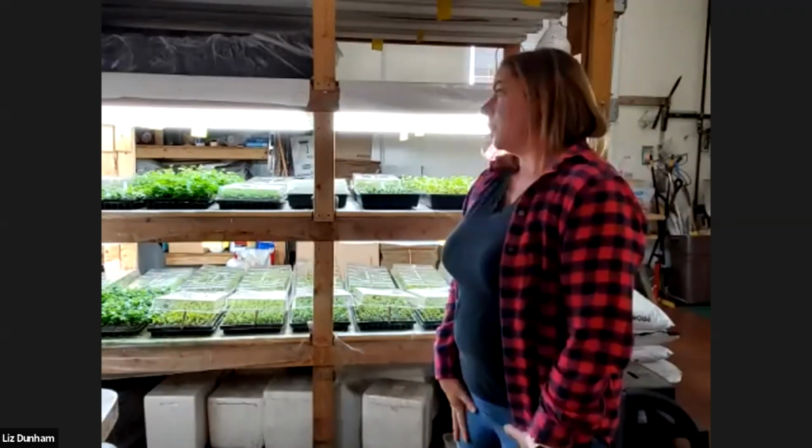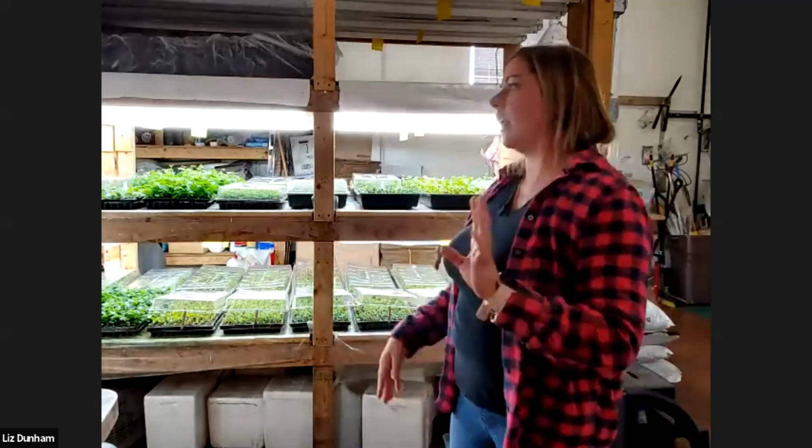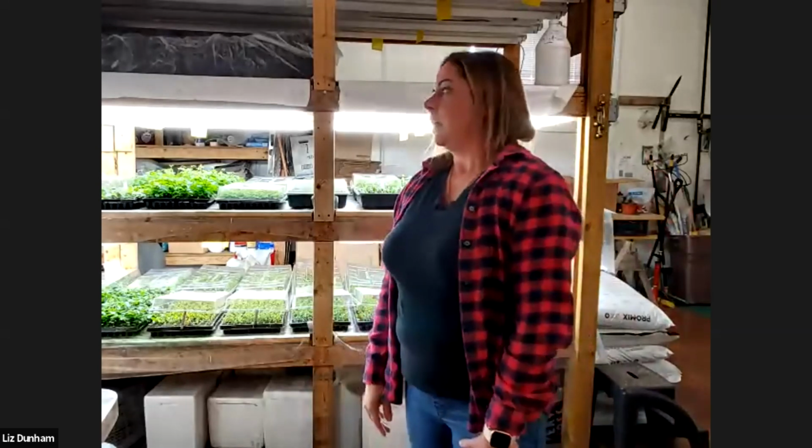They are also on an 8-4 time schedule, so they're 8 hours on, 4 hours off, and we turn them on and off as needed. This is not a busy season for us. This is probably the lowest that we will get in here. July, August, September are pretty minimal, although we will be starting a fall crop coming up soon. Our busy season is really January, February, March, April, and then things start to slow down.